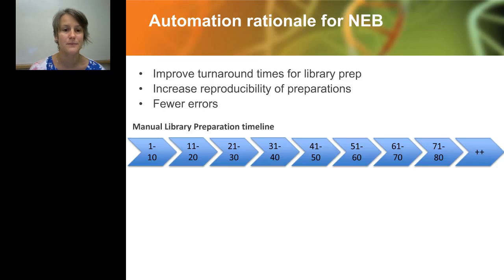So the setup that we did for the first batch of manual preparations, at most we prepared 10 libraries at a time. And so here I have depicted the time course of how long it would really take to prepare 80 libraries. If each of these bars is a day, it would take us 8 or 9 days to prepare this. Of course, that's if we're working on only this project.